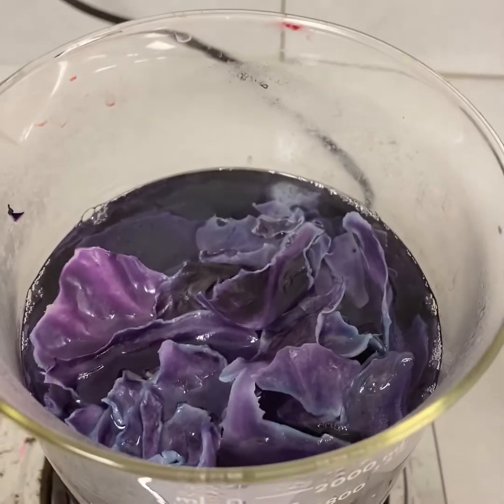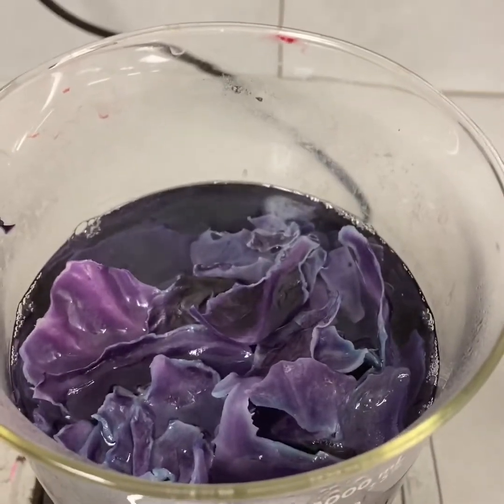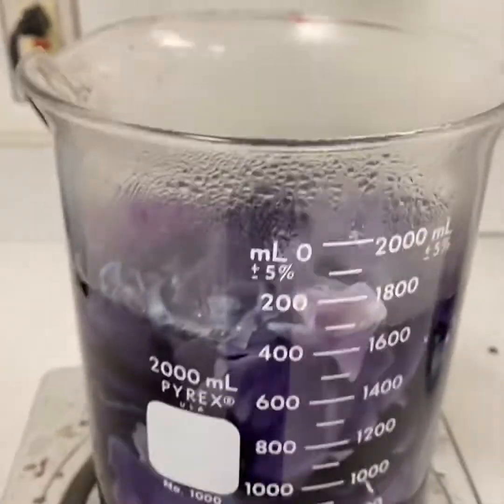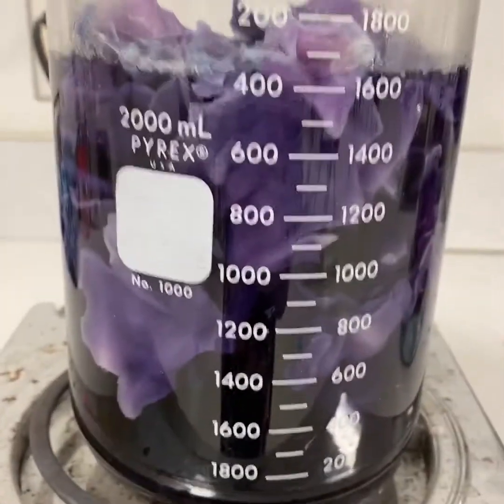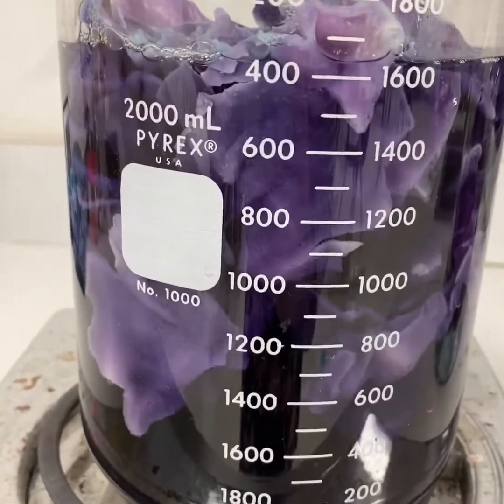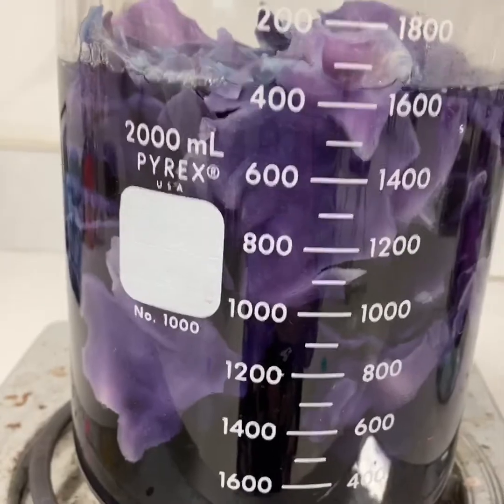An indicator are chemicals that change color in acids and bases. When we add an acid, it turns pink. If we add a base, it turns blue-green. If it is neutral, it doesn't change at all.